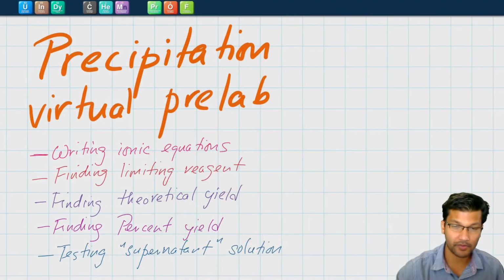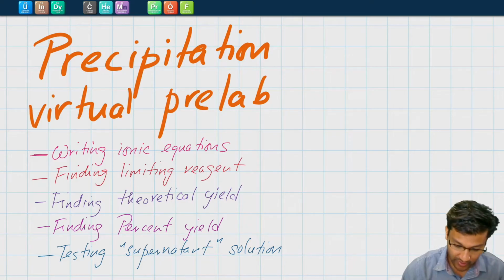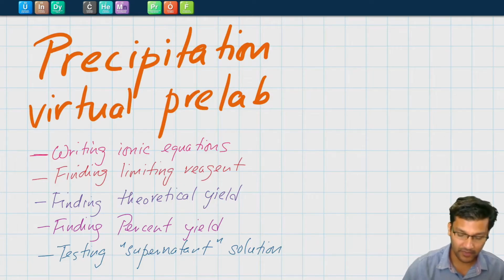You need to know for your precipitation lab. This video will be divided into five sections. We'll look at writing ionic equations, finding limiting reagent, finding the theoretical yield, finding the percent yield, and testing the supernatant solution. You can skip forward to any of these sections that you think you might need.